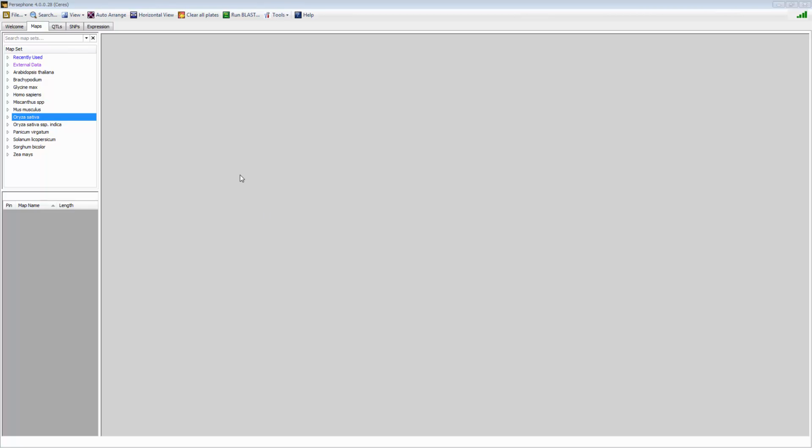Hello, this video will address looking at multiple chromosomes simultaneously, as well as zooming in and out of those chromosomes, either together or one by one.